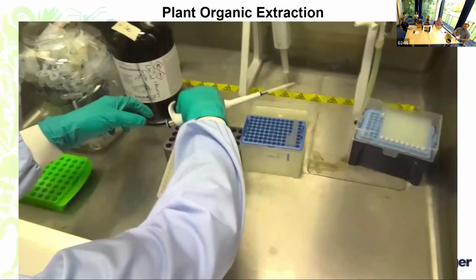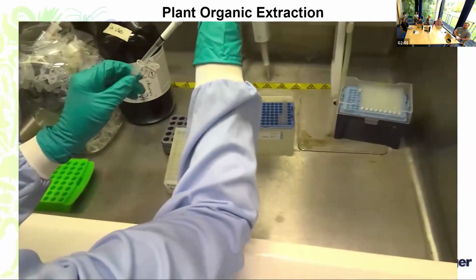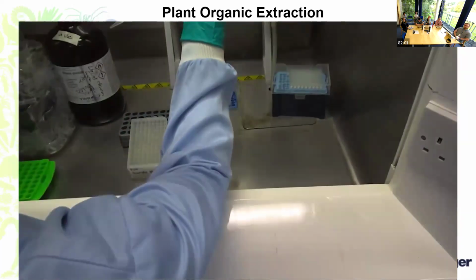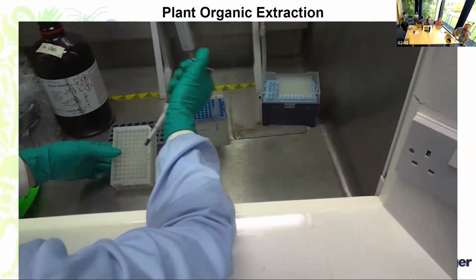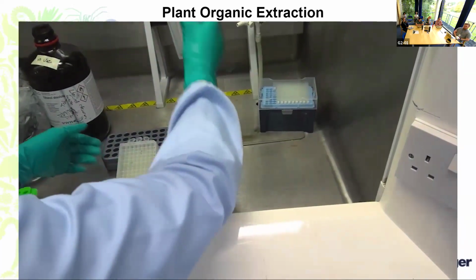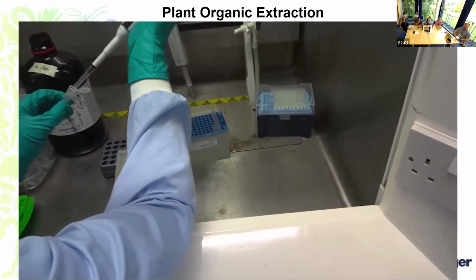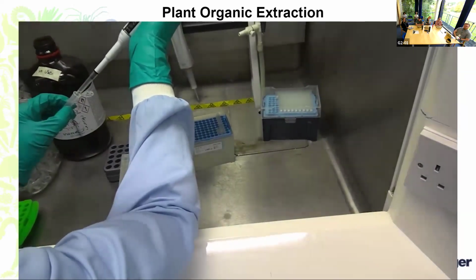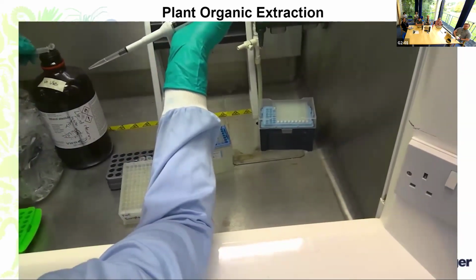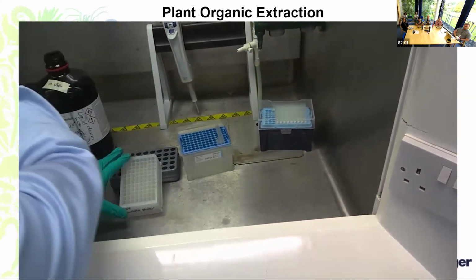This phase separation purification step is then carried out again, which has been skipped here. But then you will proceed to the automated DNA capture and purification using a double bead method. So we have an in-house Ceramag SpeedBead solution that is used here initially, followed by a 0.45 AMPure PB bead size selection. This is used to capture the DNA from the aqueous phase that may contain some residual contaminants, water soluble, perhaps some chloroform that carries over and the likes, and this is done automatically on the KingFisher.